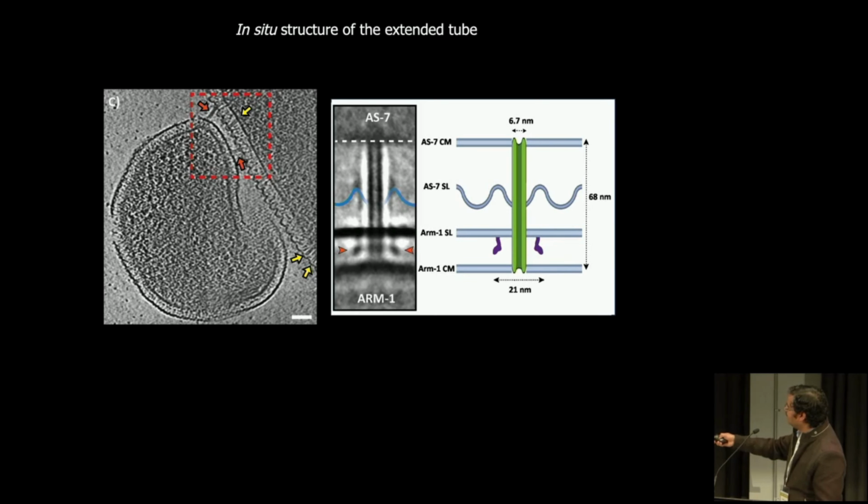cell. And you can see that it's a tube extending from the S layer and connecting to the smaller cell, the DPANN cell. In the DPANN cell, there is this secretin-like density, or a barrel-shaped density, right there. It's kind of like a space station. You've got a rocket that has gone to space and is docking with the space station.